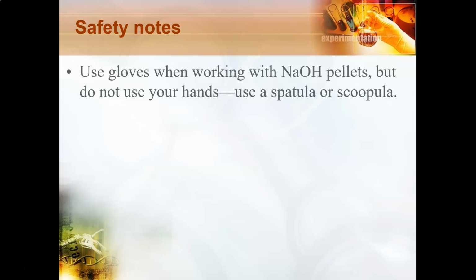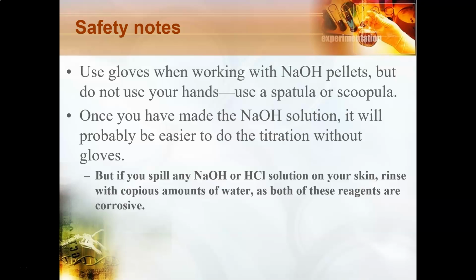Okay, safety notes for today. When you're working with NaOH pellets, again, don't use your hands, use a spatula or scoopula, and you should still be wearing gloves. Once you've made the sodium hydroxide solution, it's fairly dilute. As long as you're careful, it probably will be easier to do the titration without gloves. So just decide how comfortable you are with that.